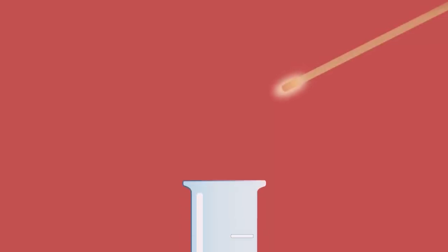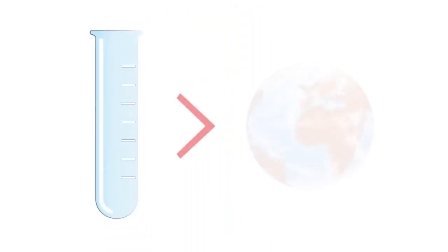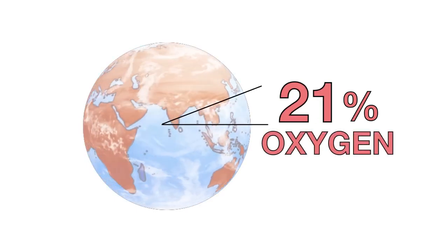Hydrogen is highly flammable, and the pop sound that you hear is actually a mini explosion. The glowing splint relights in the presence of oxygen as there is a higher concentration of oxygen in the reaction vessel than compared with air, which is only 21% oxygen.